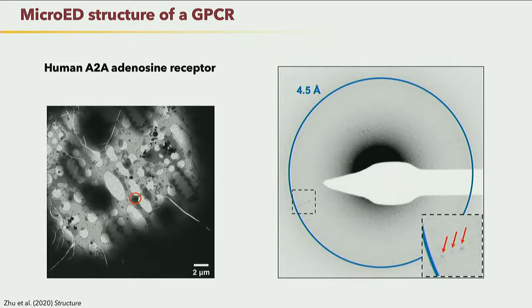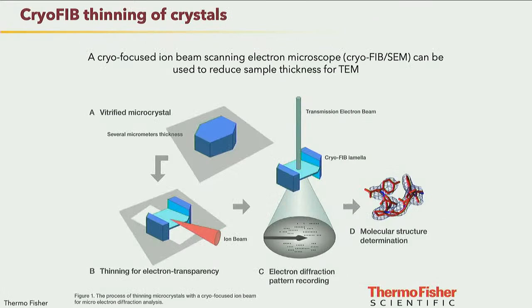And then this is where we moved over and started collaborating with my old postdoc advisor to couple the techniques we just developed, how do you reduce the viscosity and get the samples on the grid, with a new technique for how do you then control the thickness of the crystals on the grid. And so we use a process called cryo-FIB milling. So you might be familiar with this if you know cryo-electron tomography. This is what they use to cut cells down and get really nice thin sections in the middle of cells so they can image and do tomography inside cells. We use it on crystals.